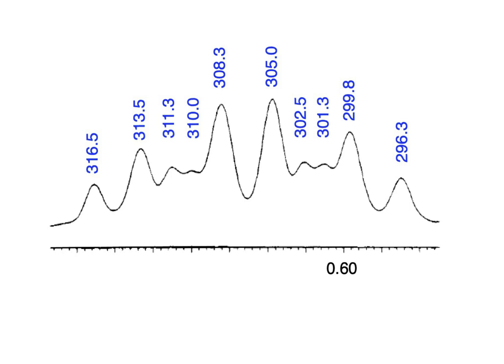But the first two, I think, are probably 1 to 2. The third and fourth one are lower, and there's some overlap. So perhaps it's not unreasonable to think that those are fundamentally ones. And then the big one, if we make that a 3, so far our sum is 8.